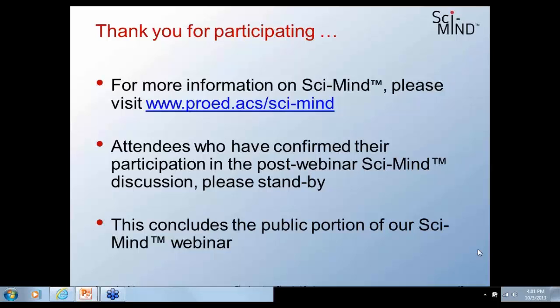I like the question. How would you start developing a method for a new product where no study was made before? Again, that's a great question. What I'm going to do is ask a lot of questions of whoever brought me that material to work on in the first place. I'm going to go to the synthetic chemists at my company and ask them all those questions that we talked about up front. I'm going to ask that of the development chemists at my company, and try to get as much of that information from them as I can, because that's going to help me develop a better method for them.